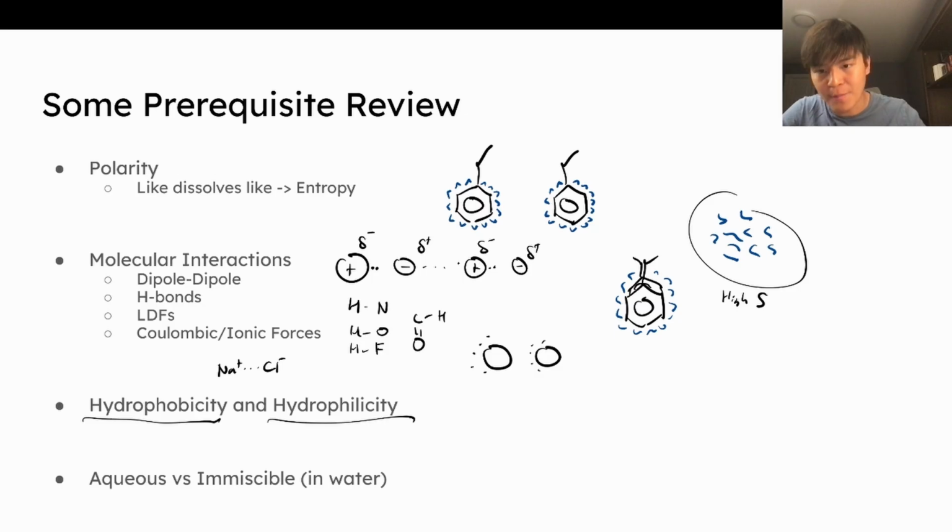So something that's hydrophobic, imagine oil, right? Or you ever see those leaves, wax, right? If you see the leaves that you drop a piece of water on and it doesn't dissolve at all, it's very round and smooth. That's a hydrophobic surface. Hydrophilic, think of our skin, for example.